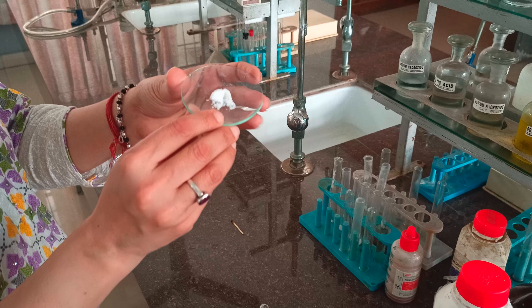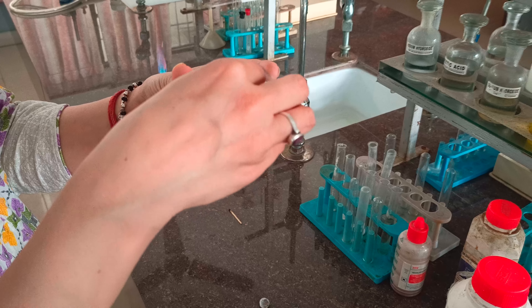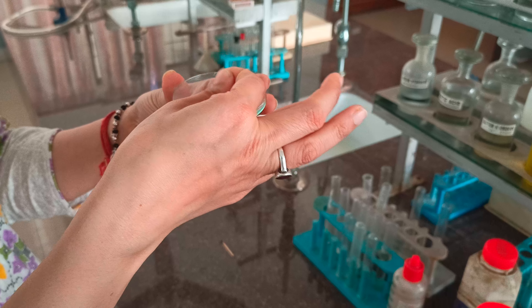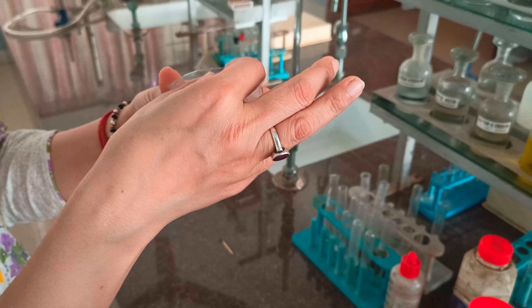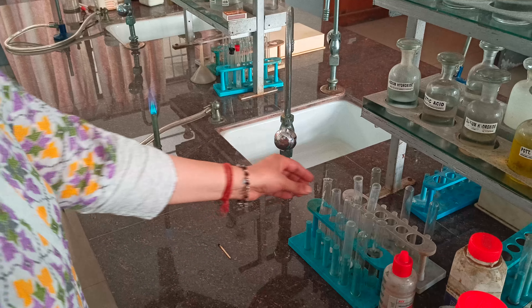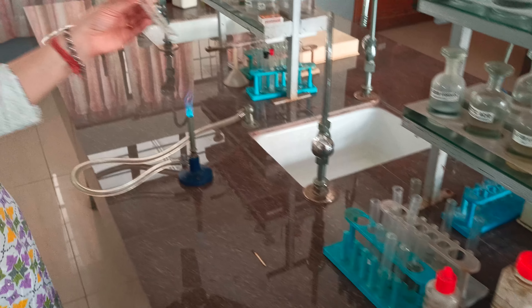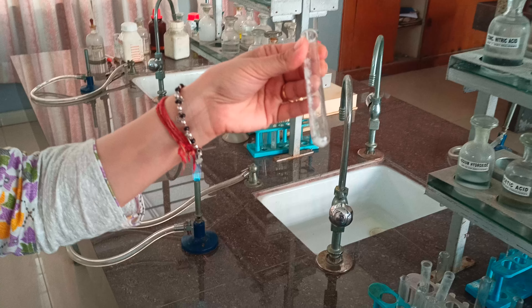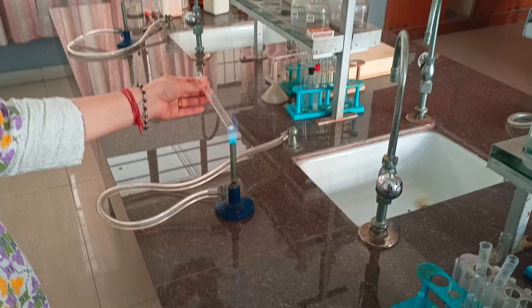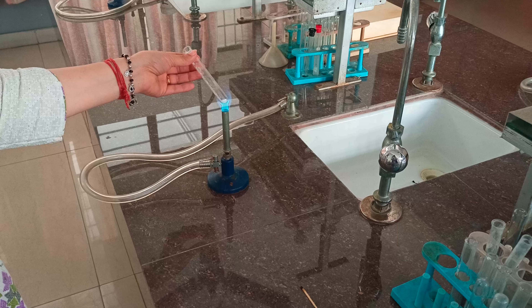Its color is white, and we can check the smell — it is giving a chemical smell. That is the color test and smell test. The third step is the dry heating test. Let me take a pinch of salt and perform the dry heating test. We are going to heat it.